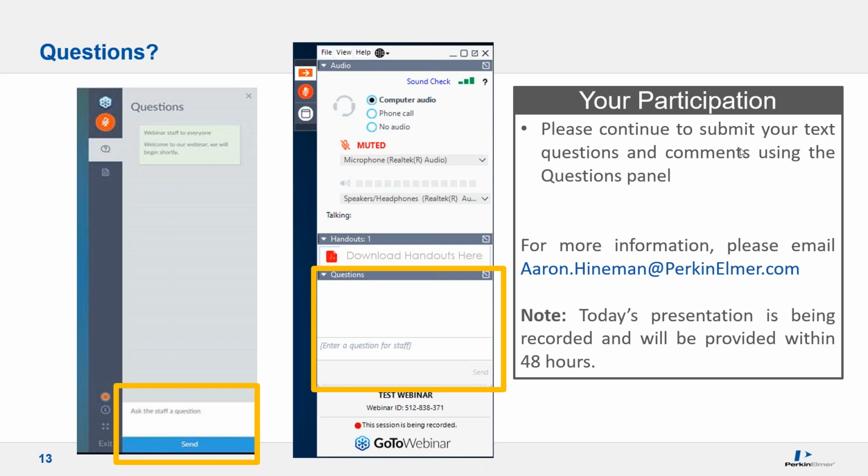All right, so we have the first question here. Should you ever have to remake an MSF model? That's a pretty good question. So not regularly. The only thing that needs to be constant with MSF models is the peak shape. So as long as the peak shape is not changing drastically, you should not need to redo the model. Yeah, so they're pretty stable.